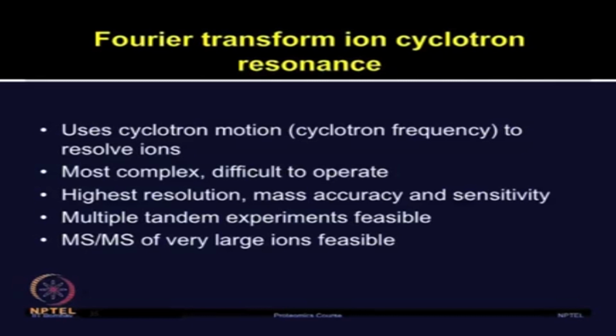Although operationally it is very complex and not very easy to operate, it provides the highest resolution, mass accuracy and sensitivity. It also provides the capability of multiple tandem experiments, and MS/MS of very large ions is possible by using FTICR MS.